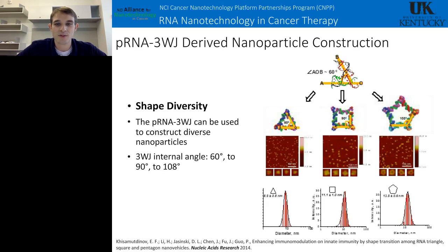We have the AFM images, and we see very distinct and compact nanoparticles, and our dynamic light scattering data shows very uniform shape and size. Because of this, ultracentrifugation is perfect for us to use to purify these nanoparticles, because they will all migrate distinctly based on their sedimentation rates.